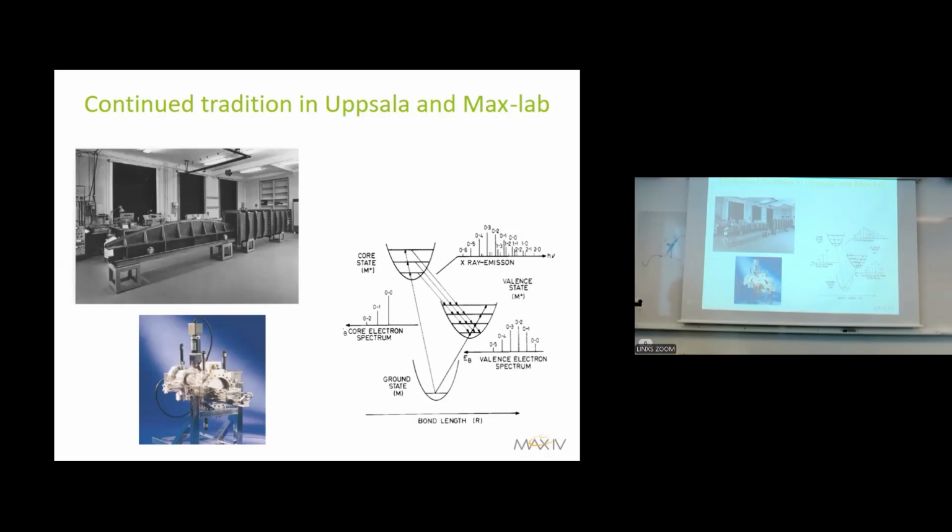But it worked very well. Actually, we're still struggling to reach the resolutions that they were able to achieve. Down here is a development from that. That was the first commercial X-ray emission spectrometer developed by Såthe together with the group in Uppsala, so you can actually buy them commercially.